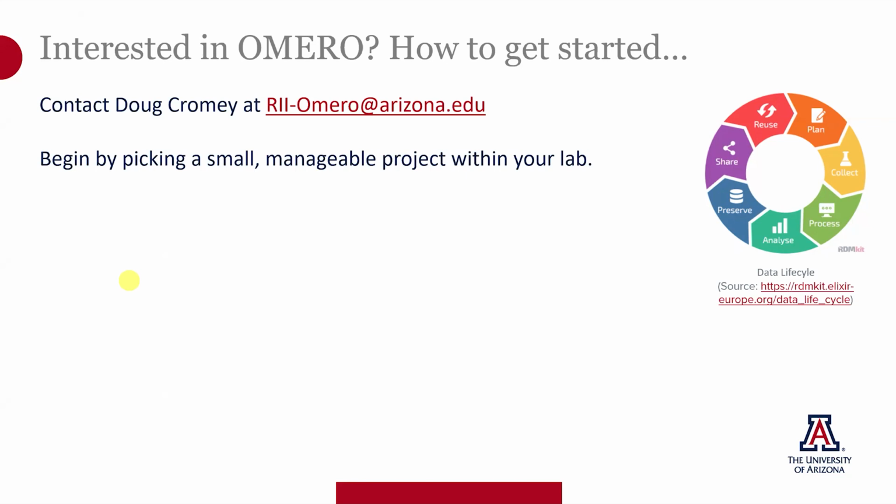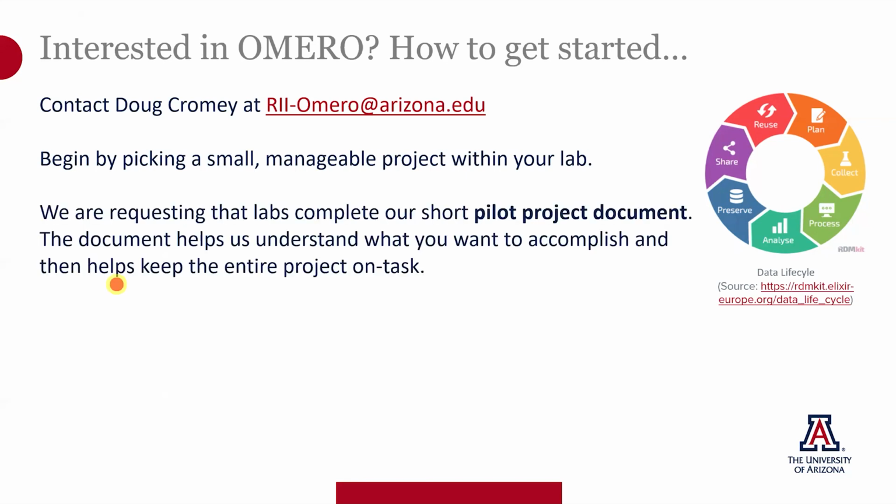That way you don't get overwhelmed by collecting all the metadata that you might not have realized you needed to do. We do have a pilot document that we ask people to complete so that there's a way for us to understand what you want to accomplish, and also so that we can all stay on task.